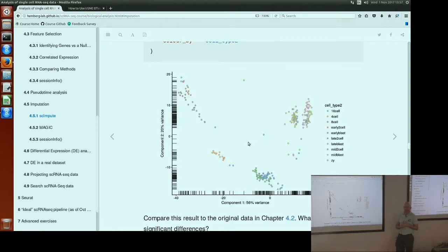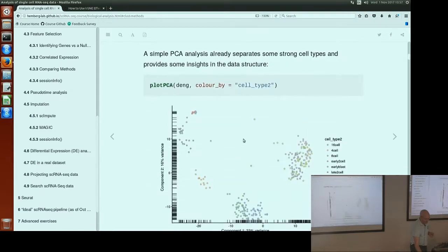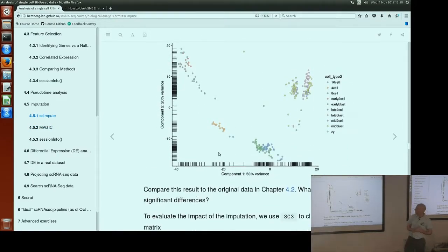So if you want to do that. So this was the old plot. Back is not working. Okay, I'm going here. And this is the new plot. So not too much of a difference, I would say. Is everyone in agreement with that conclusion?